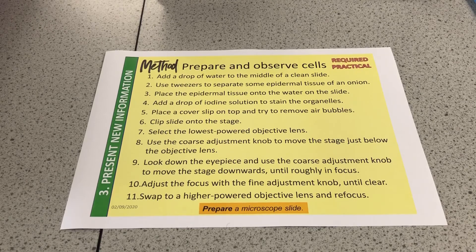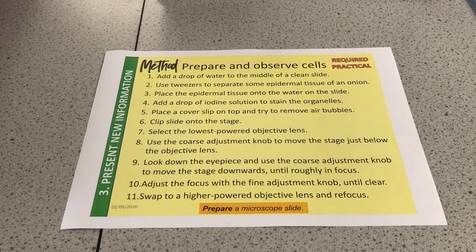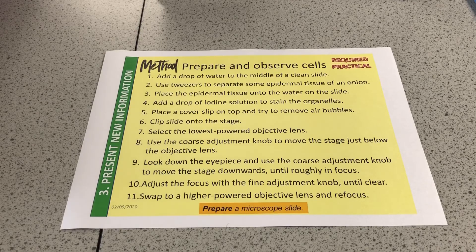Try to remove any air bubbles by giving the cover slip a small tap. Clip the slide onto the stage to keep it steady. Start with the lowest powered objective lens and use the coarse adjustment knob to move the stage just below the objective lens. Look into the eyepiece and use the coarse adjustment knob to move the stage downwards until roughly in focus, then use the fine adjustment knob until it's clear. Then increase the magnification — I had times ten in the eyepiece and times ten in the objective, so one hundred times bigger.